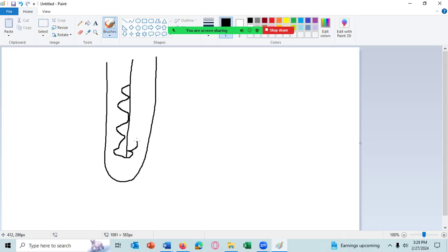It can grow differently on this side. So I'll make that a big one there. This is slightly motile bacteria. It can swim, and that's why it's flaring from the stab mark. Any questions about that?